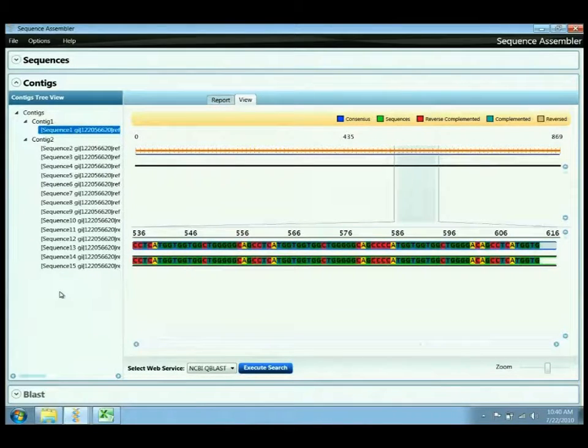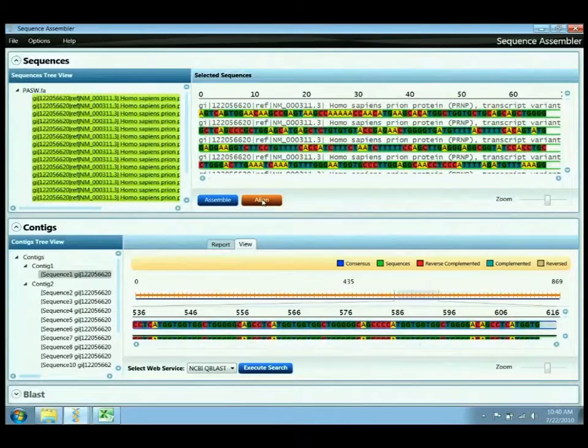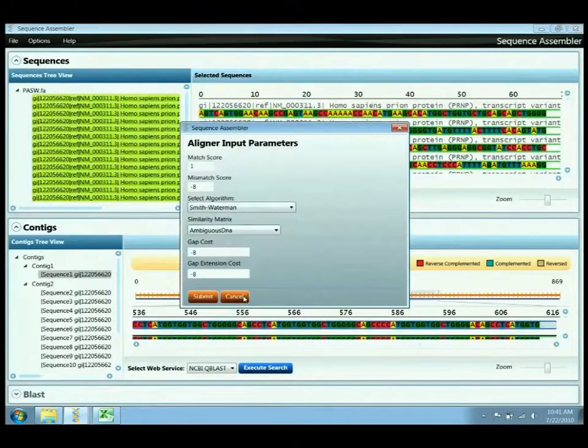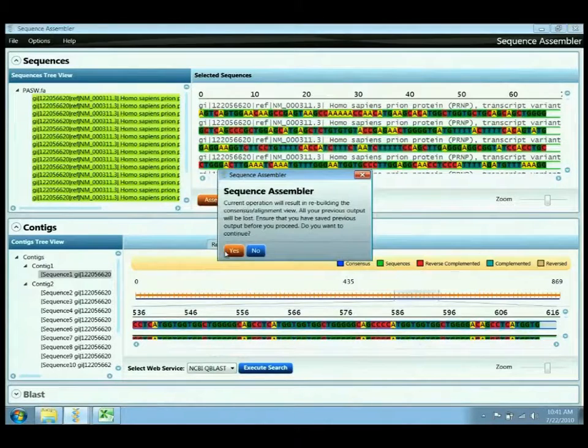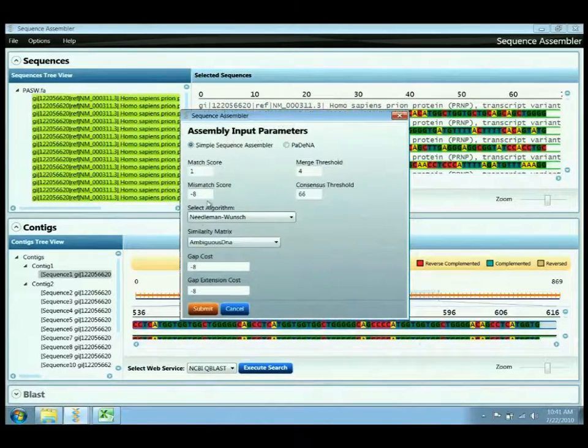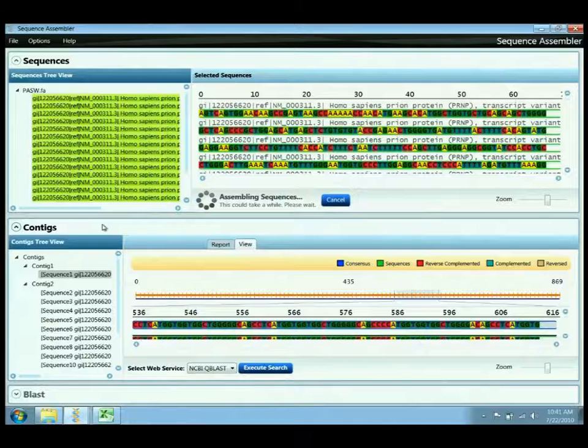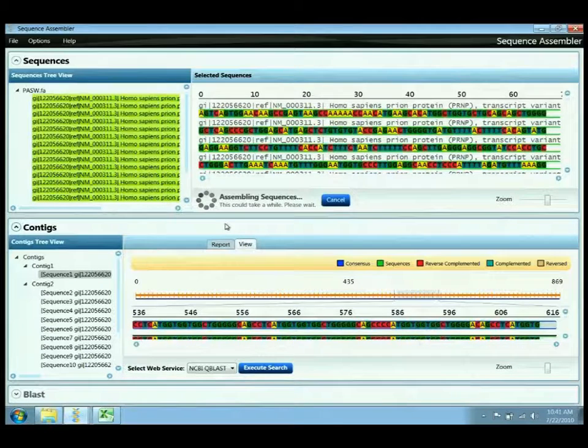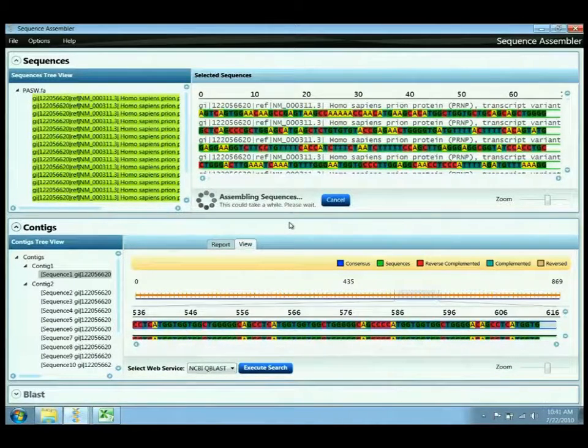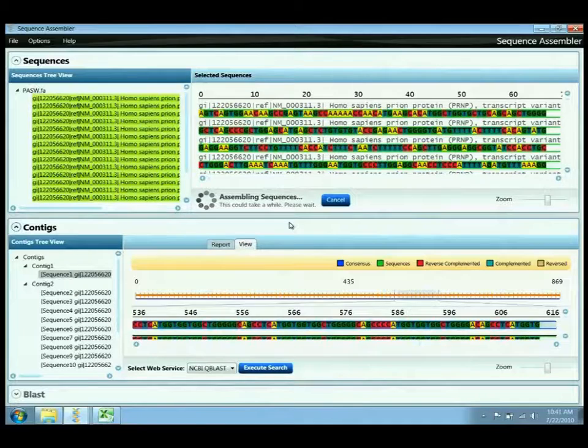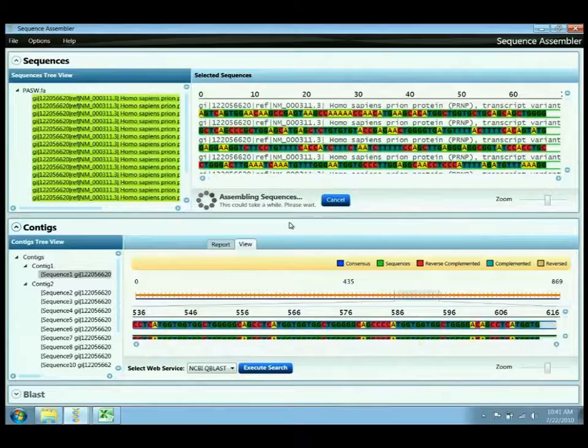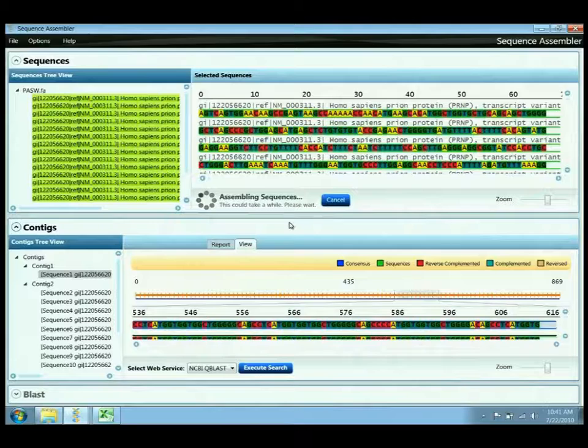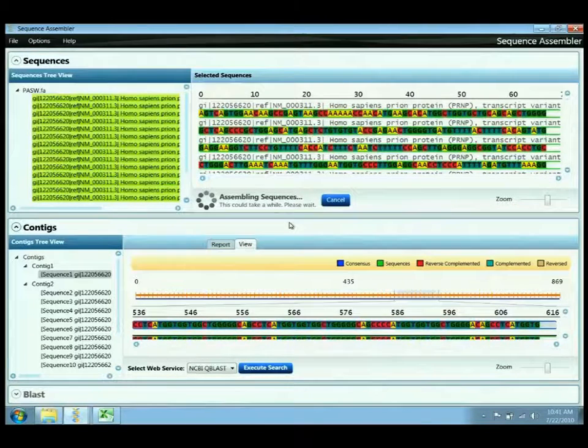And if I go back to the input sequences, I want to do an assembly using the Smith-Waterman algorithm. I'll use the ambiguous DNA and I'll submit. Now what will happen here is this will actually take a lot longer to be performed. The Smith-Waterman is a pairwise alignment algorithm, and to do an assembly with a pairwise alignment algorithm using a brute force simple pairwise assembly takes a much longer time.